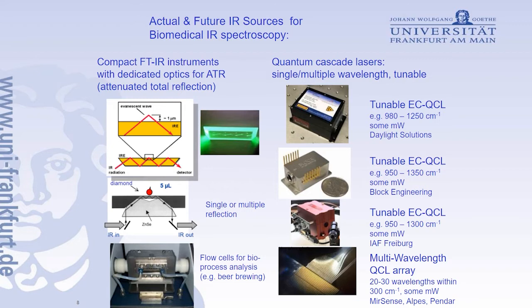So the sampling side is also simple today and established today. Now, as I said, we have a second sort of infrared sources, namely quantum cascade lasers: powerful, compact, tunable light sources with lots of photons, which eliminate one of the problems of our spectroscopy. And we have either tunable lasers or laser arrays with lots of wavelengths, which make spectroscopy an easy issue.